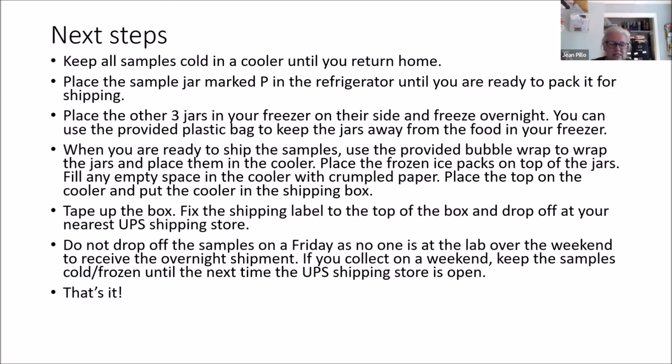Now we can sample on a Saturday as long as the samples are frozen until we're ready to ship on Monday. But you can't ship on a Friday because the lab is closed on the weekend and these things are going overnight. So if you ship on a Friday, there's no one to receive them. They'll defrost. The samples won't be worth anything. So that's it. Anybody got any questions?